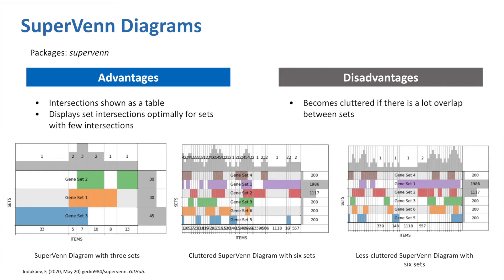You can see this in the 3 diagrams shown, as we see a clear diagram on the left, a cluttered diagram in the middle, and a less cluttered diagram on the right by ignoring some of the intersections.